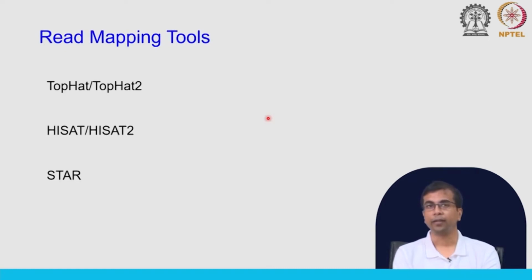There are tools that have been designed to do this kind of alignment. One is called TopHat or TopHat2, one of the earlier tools. It is based on the Bowtie2 or Bowtie program, an extension of Bowtie using the Burrows-Wheeler transformation, and it was very efficient and fast, but now it is not used that much. Then there is the class of tools called HISAT or HISAT2. This is also quite widely used now, and you have STAR.